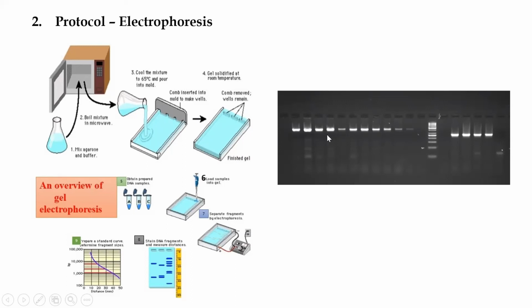So for our NRF2 knockout, in which the gene was not present, the bands were like this. This was the NRF2 plus plus, where the NRF2 gene was present. We know the molecular weight of the PCR product. Those DNAs will differ in their molecular weight, and you can differentiate between the two DNA samples. You can then extrapolate that this DNA sample from this mouse means this mouse was NRF2 knockout, and this one is NRF2 plus.